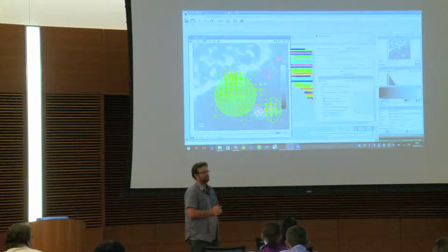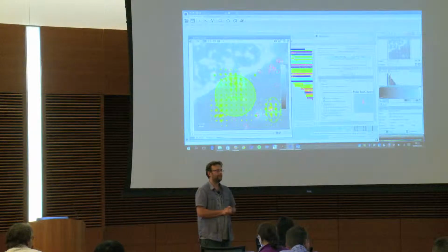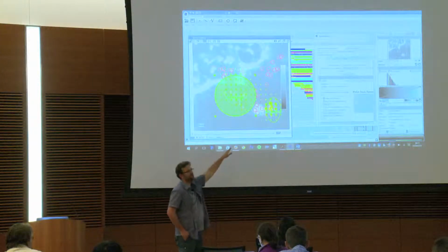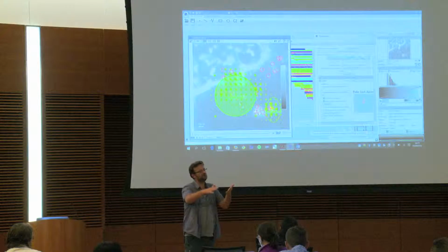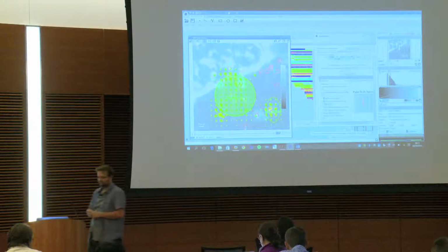It's the same. You do exactly the same. Because when you are playing in 3D, you remember the ROI that you saw before. When you are doing it in 2D and in 3D, they do not appear the same.